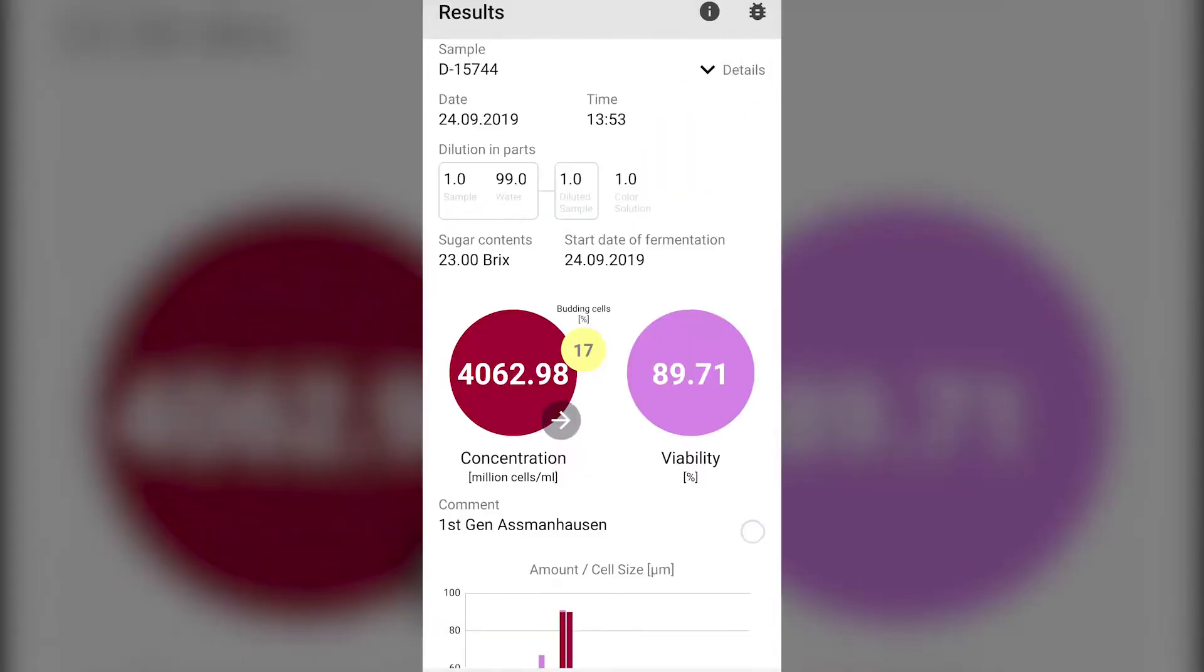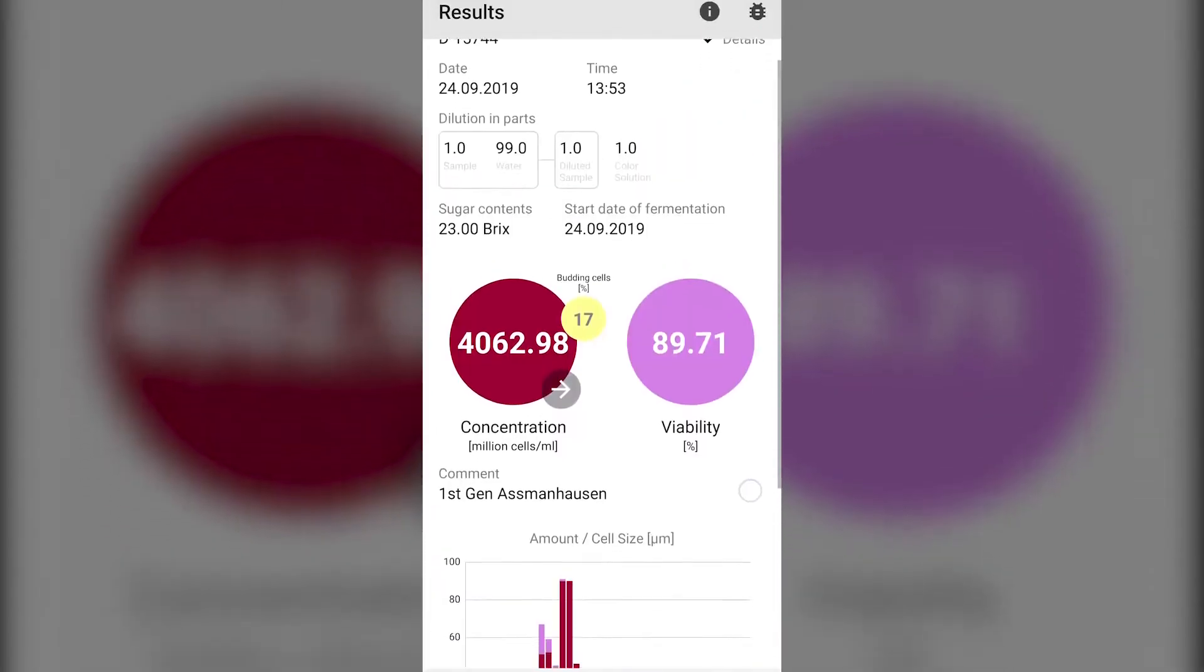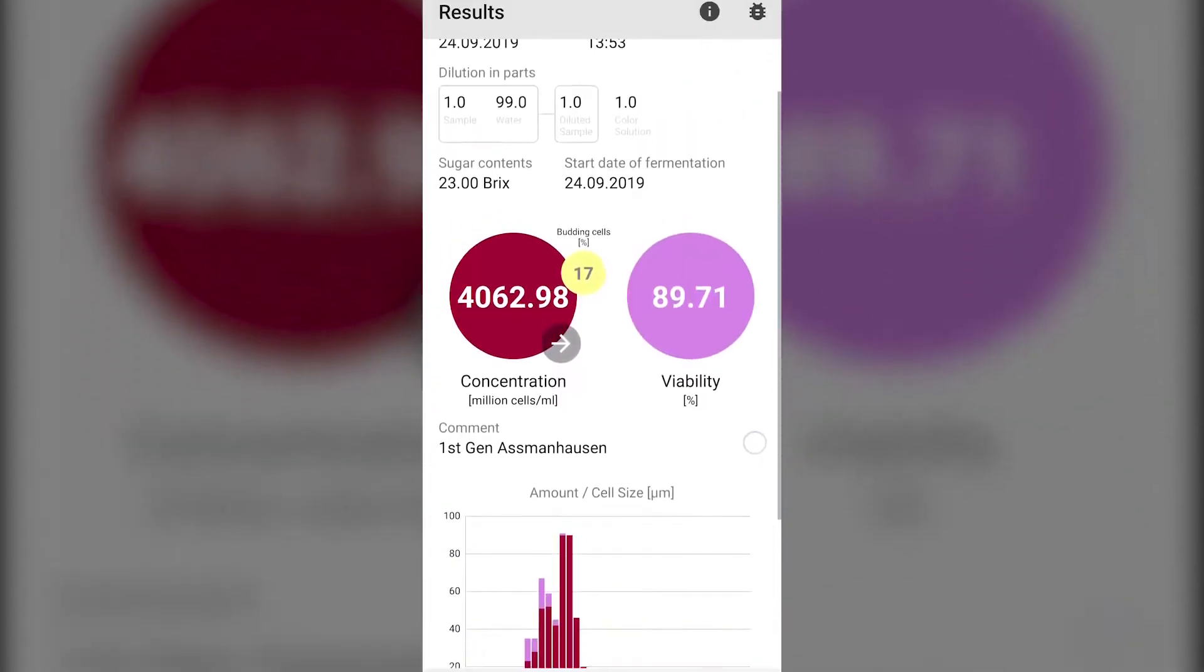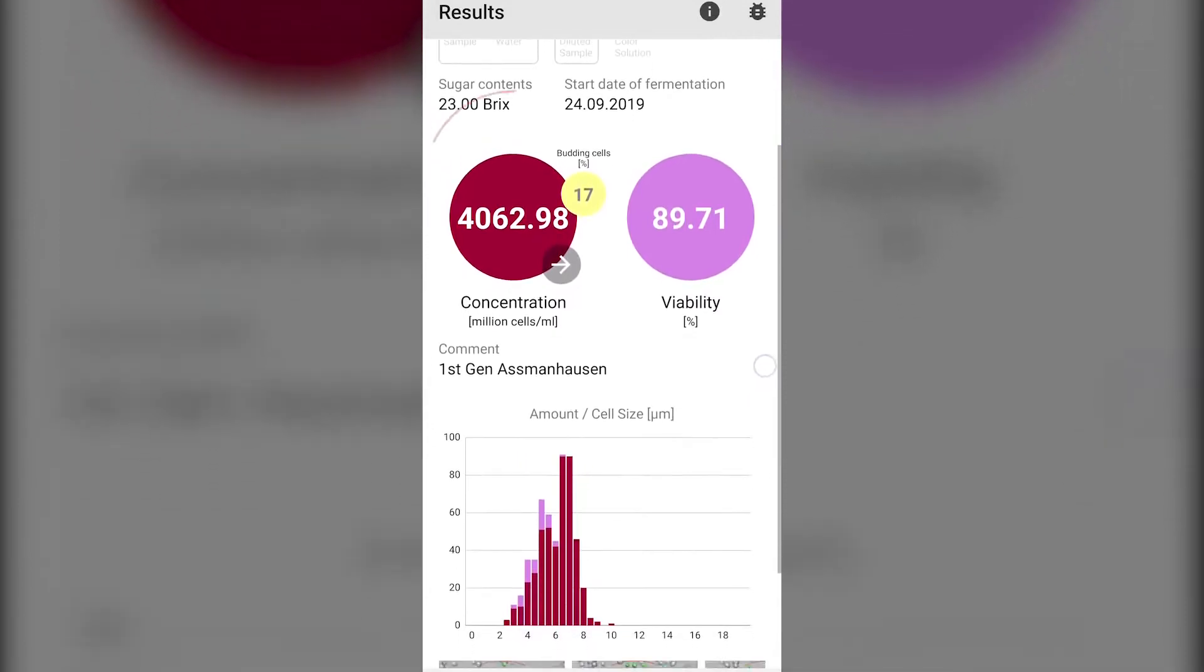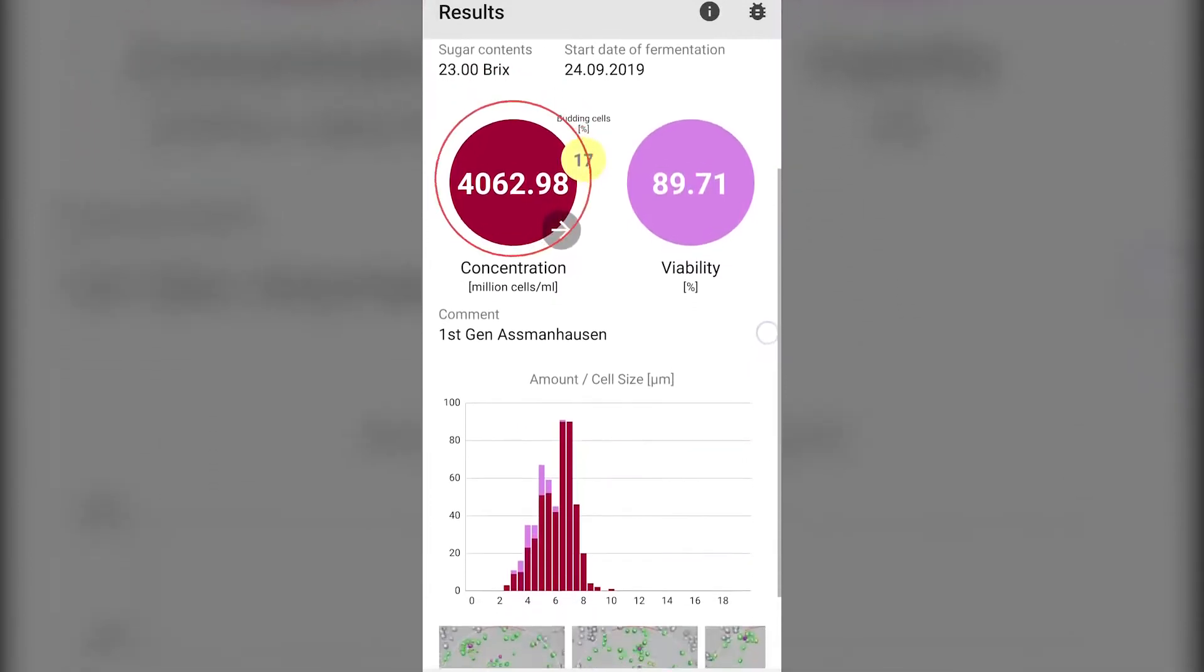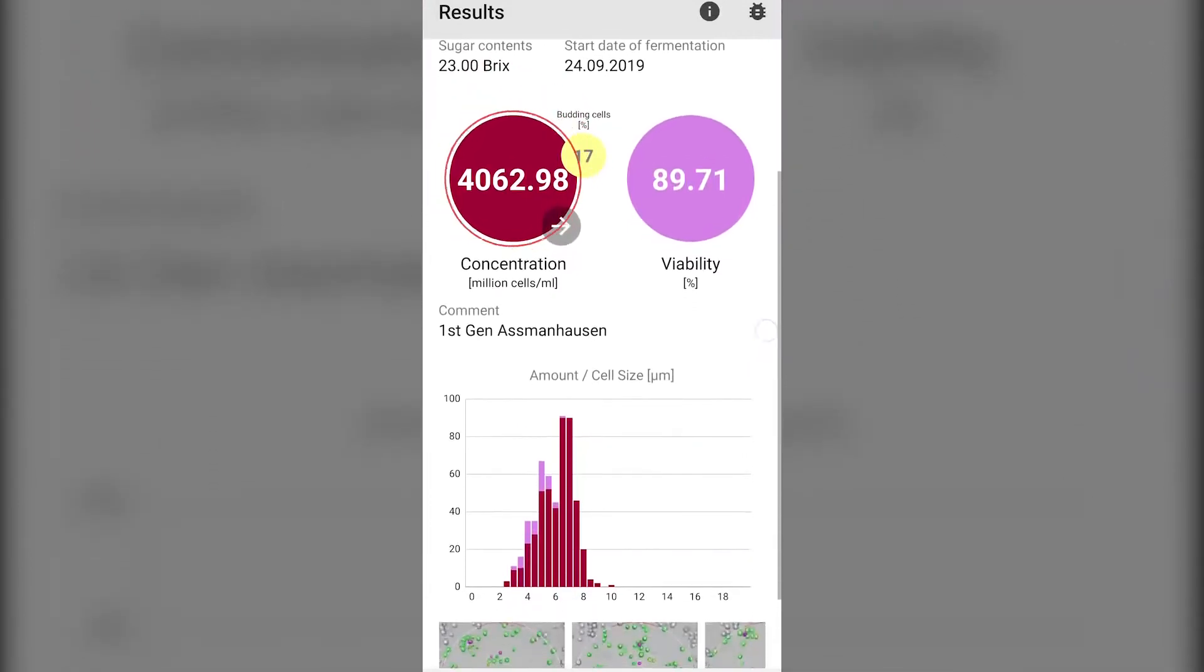The results of the analysis are easy to follow. On the top left of the screen in the burgundy circle is the concentration of the sample in million cells per milliliter.